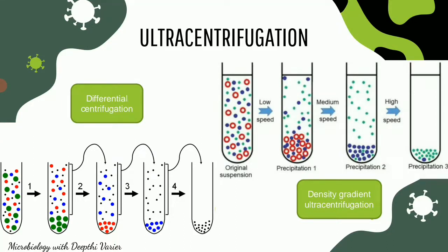So from the regular centrifuge, this gives us an additional advantage because the spinning speed is much higher. And viruses being really tiny particles, you need to spin them at such high speeds to separate them out or to differentiate them. Now, the ultracentrifuges have been developed since the early 1900s, and we have been using them for the differential separation of various cellular components, not just viruses, but even for organelles, for separating out the lipid membrane, and even purifying DNA and RNA.